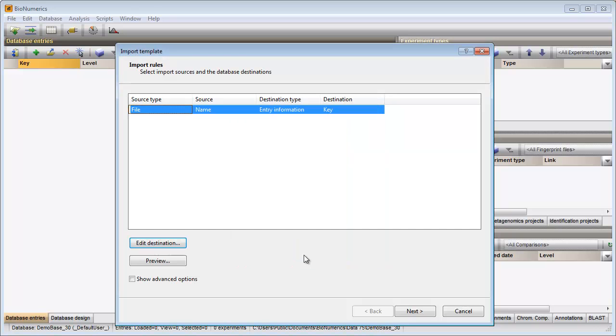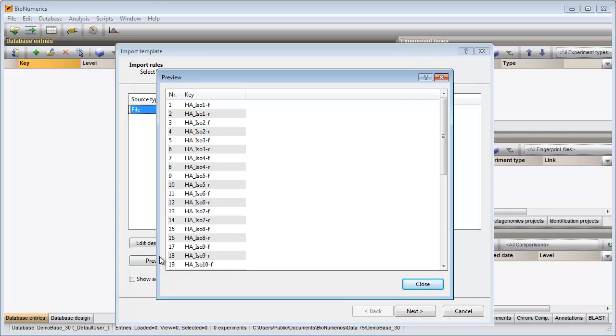If I now press the preview button, I can check the rule that I have defined so far. From the preview I can see that not the complete file name should be linked to the key field, but only the part that appears between the underscore and the hyphen.